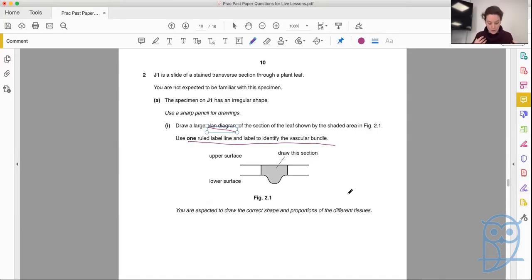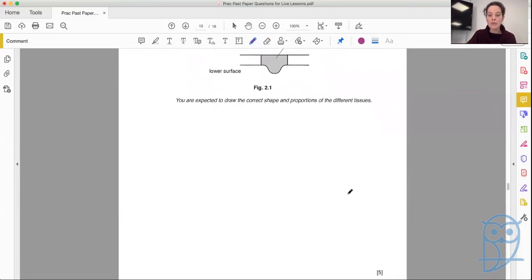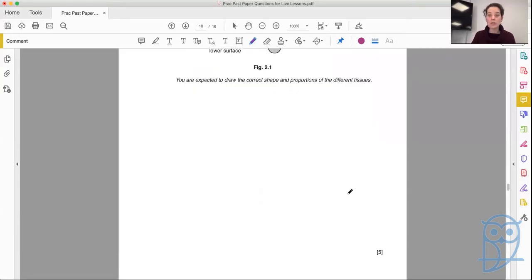So for example, on page 130, there is an image, a photomicrograph. So you've got an image of a leaf and you have a similar bump in the middle. So we can draw the relevant piece out of that image instead. Okay, plan diagrams, remember, don't have any cells whatsoever at all. We're just drawing boundaries of the tissue.